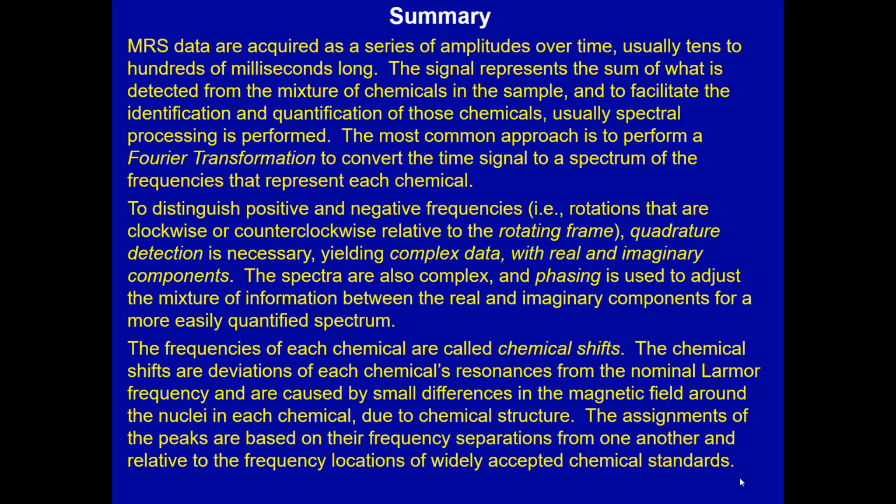And then, if possible, you make some kind of intervention or look for a disease where you know this chemical is altered, and you see whether this chemical is enhanced, like in the disease. If you give a drug that blocks the breakdown of the chemical, is it actually what you're seeing? So Kevin Behar in the late 80s and early 90s was making the first measurements of GABA in the brain. One of the interventions was to give a drug called vigabatrin, which blocks the breakdown of GABA. And the peak he believed was GABA rose as expected. That was one of the steps he took to verify that what he was measuring actually was GABA.